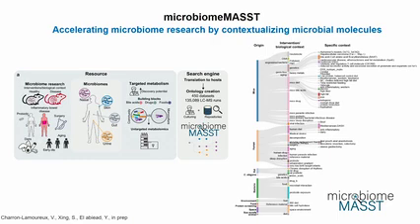So this is the new, what you have here. It's the different origins, so if it's mouse, human, rats, different bacteria. We also have space samples, we also have pig, different animals, and we have also in vitro protein screening assays. You have different biological contexts, different interventions, so it could be a lot of different genetic mouse models. You have different diet interventions.